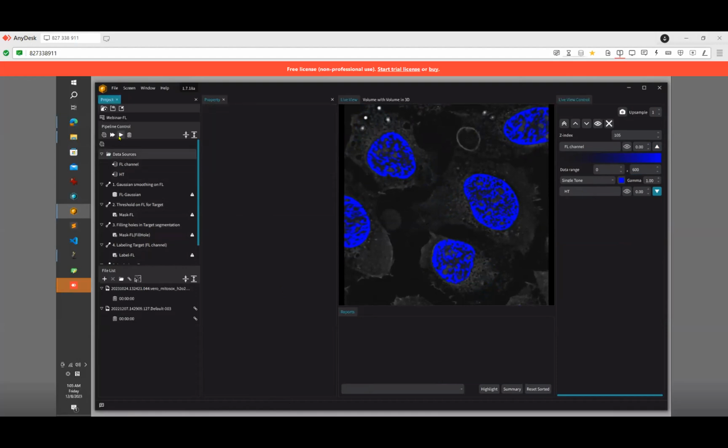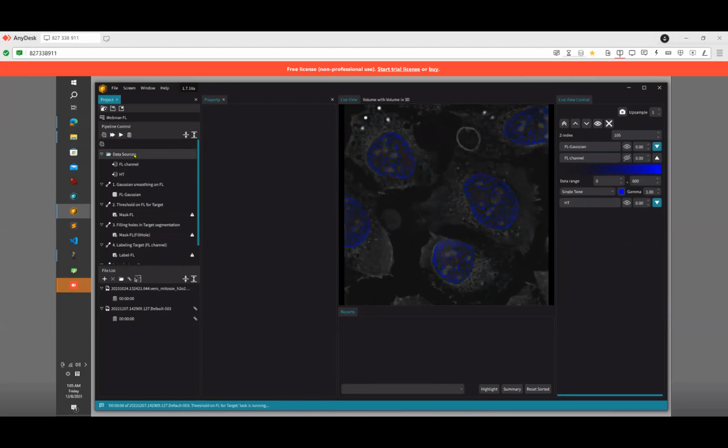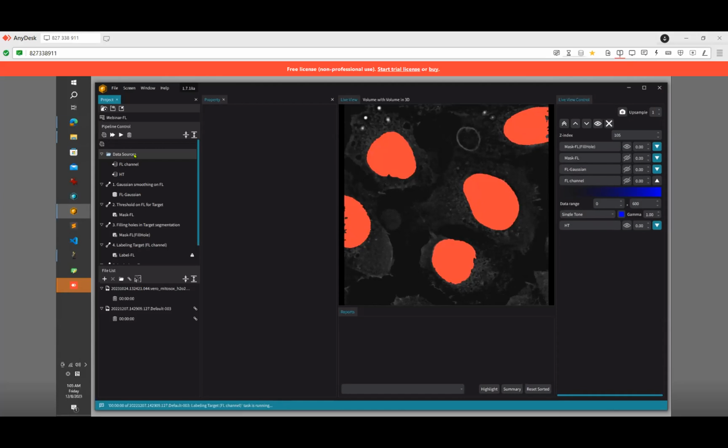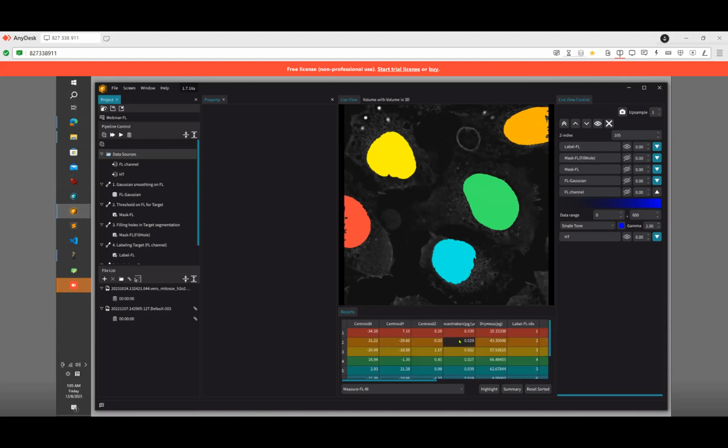Let's just run this small single triangle to see how it goes. So it does the segmentation, then post-processing to fill the holes and identify objects, and from the objects it gets the result like this.